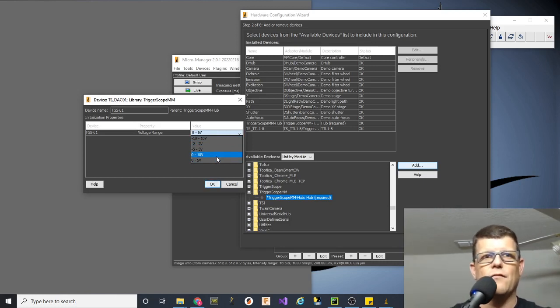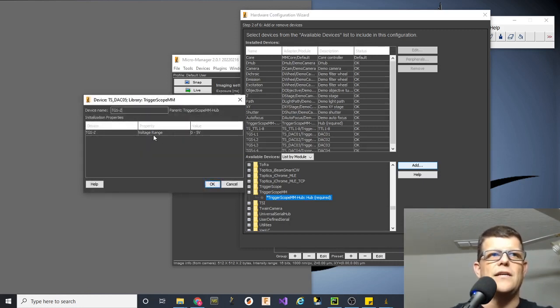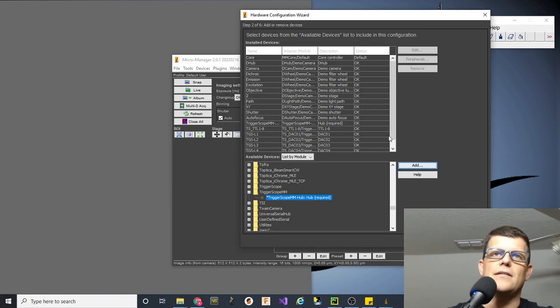And you have a number of values here. Maybe you're controlling a galvo motor. Maybe you're controlling a stage which wants a bipolar input, so -5 to +5 or -10, 10. But in our case, we'll do 0, 5. Most lasers are going to like that. All right, we'll do this for 2, 3, and then 4. That's fine. And then for our Z, we're going to choose, maybe we'll do 0 to 10, just for fun. All right, so that's done.